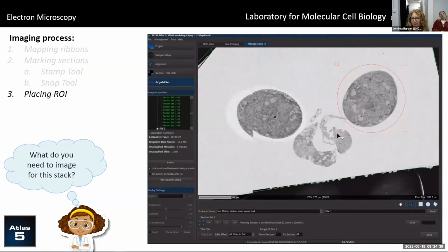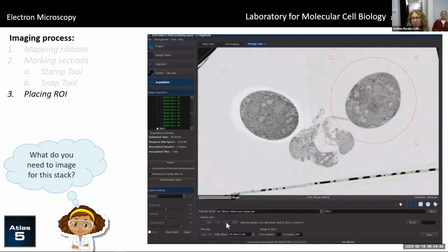You can also modify this either for one region of interest for every section, or modify each outline for each section, or each and subsequent sections. This can be really handy, especially if, like this example for a brain lobe, which is essentially a sphere, your feature of interest starts small and gets bigger as you go into the block. This means that you don't have to necessarily capture gigabytes of bare empty resin, using up both imaging time and data size, as well as computational costs later on.